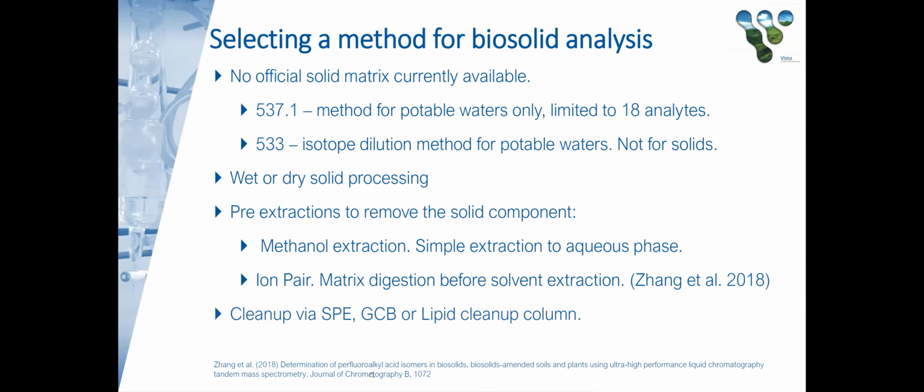The matrix properties and the extraction efficiency of the method used. In the case of biosolids, the suppression from lipids and organic matter in the sample and the difficulty removing the aqueous component would also happen to the internal standard.